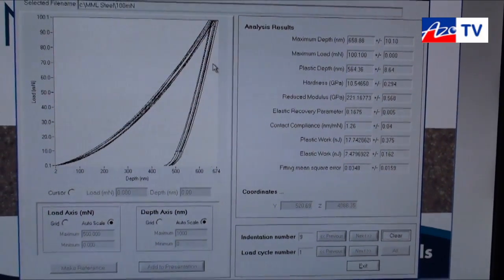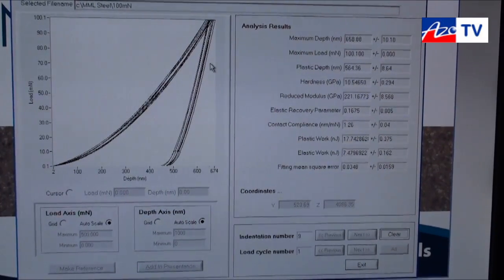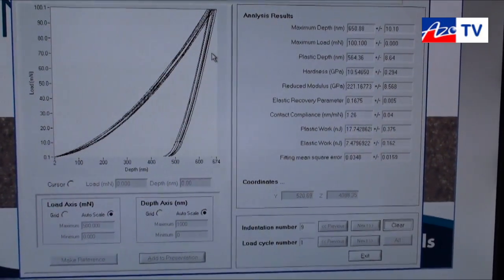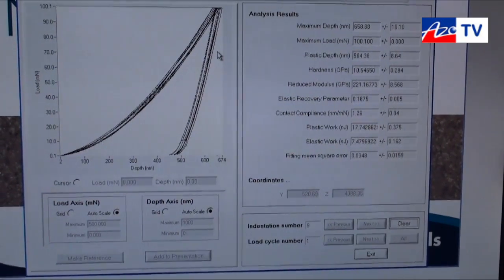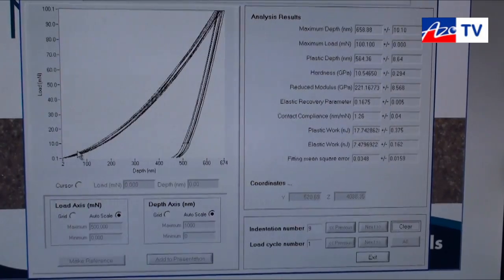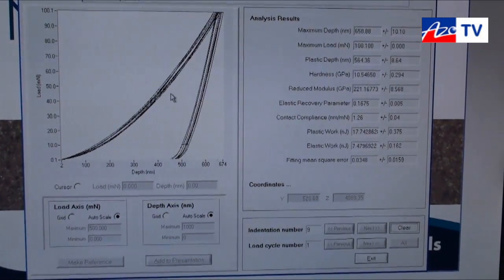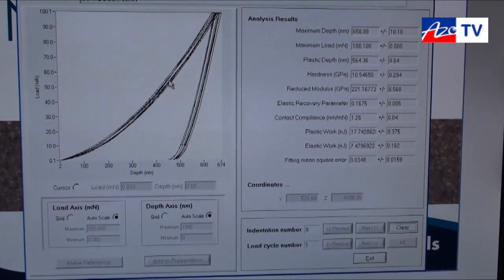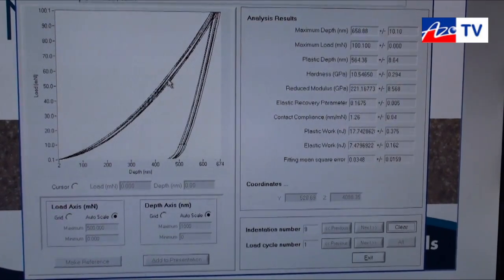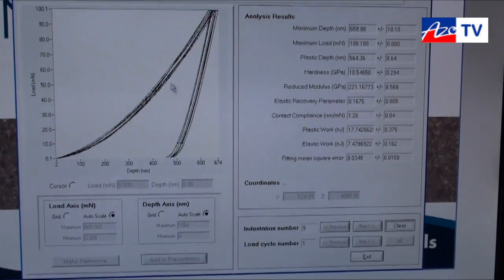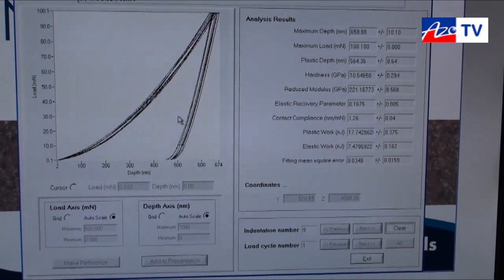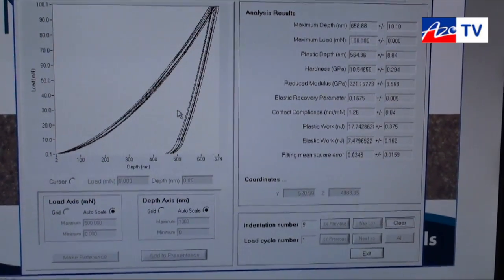So it's not critical then to have a highly polished surface to work from? Typically what we do is try and get the surface to be as highly polished as possible. One other thing that could be contributing to the difference in the loading slope here is different phases in the steel. Most steel samples are a multi-phase structure, so you wouldn't expect to get perfectly homogeneous properties from a steel sample anywhere.